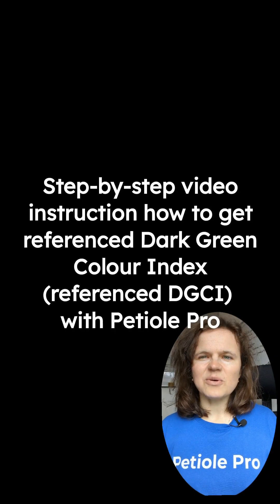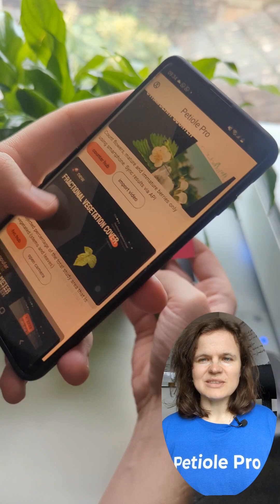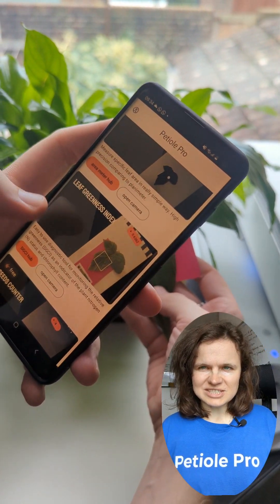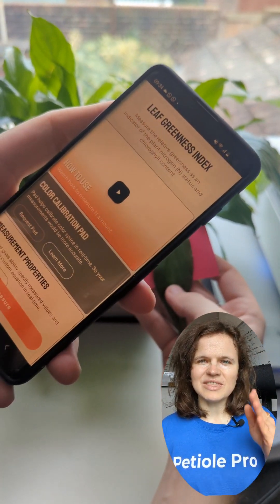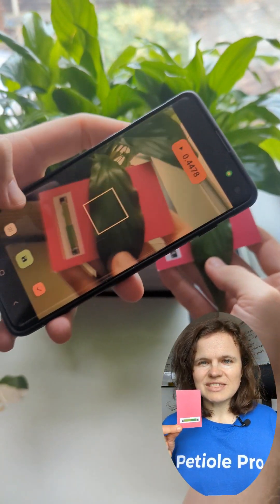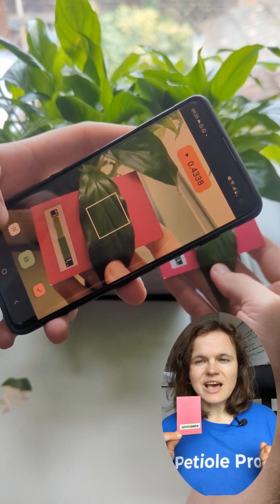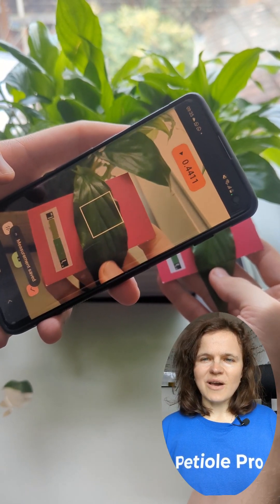Now let's see how to measure referenced DGCI chlorophyll content with PTO PRO. Launch the mobile app and go to the DGCI Hub. Switch on the calibration button located on the left-hand side of the dashboard. Then place a leaf on the color calibration pad, ensuring that the markers and the green range values are visible, and adjust the white square over your leaf.